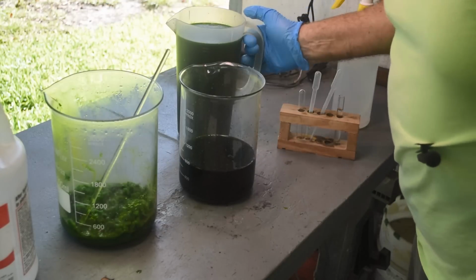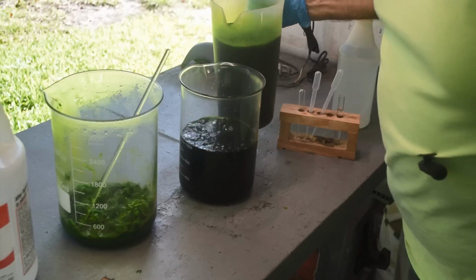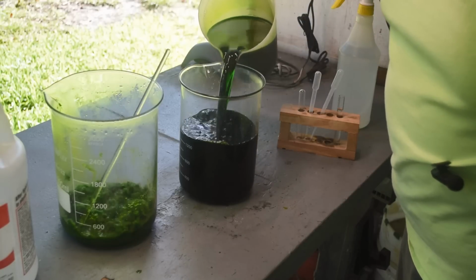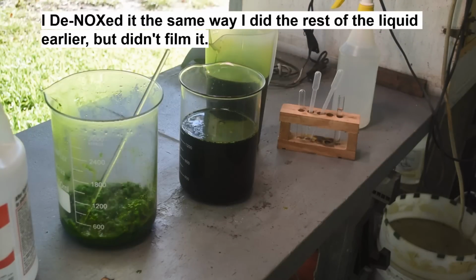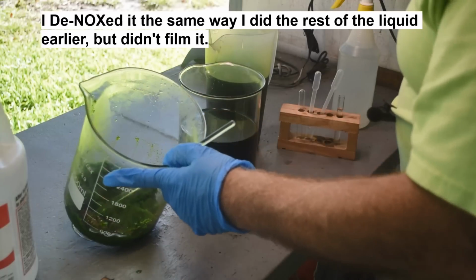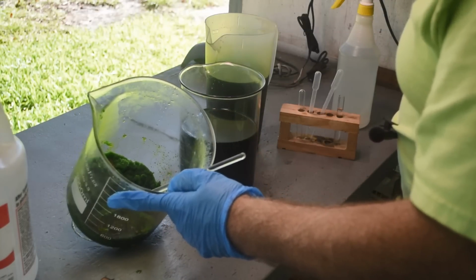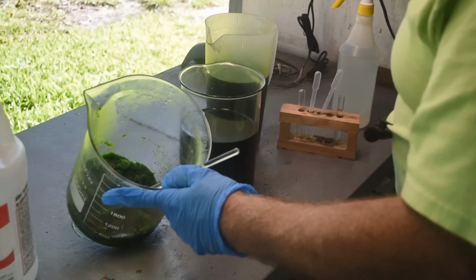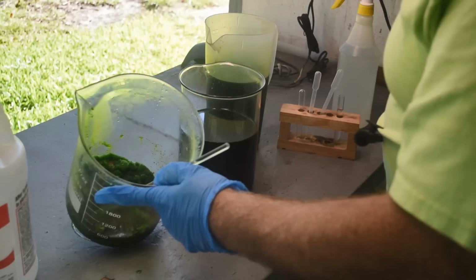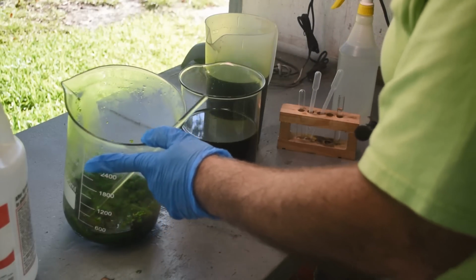Let me sort of divide this up into two more or less equal portions and denox it and move on from there. So I may just dilute this stuff with water and throw it in my stock pot rather than trying to do anything else with it. I think we've got rid of a lot of excess sodium nitrate here and probably some sodium chloride too, which is good. It's just in the way.